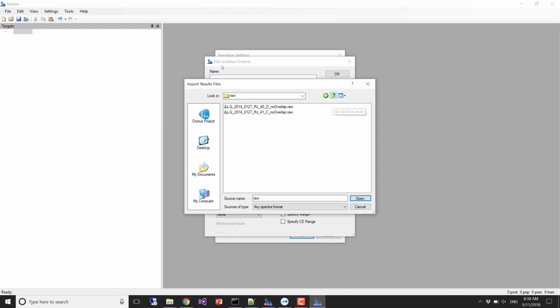Okay, so the raw files are in this DIA intro, so we haven't gotten through the intro yet. And then DIA tutorial and raw, and there are two, and we're going to import them eventually, but we're just going to choose one to get the isolation scheme out of. All good?